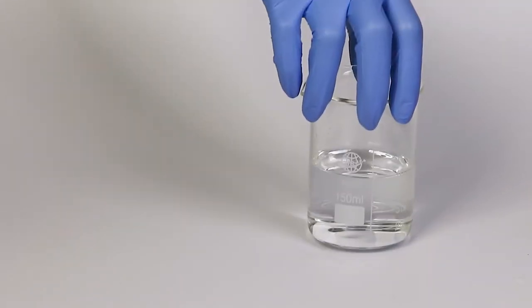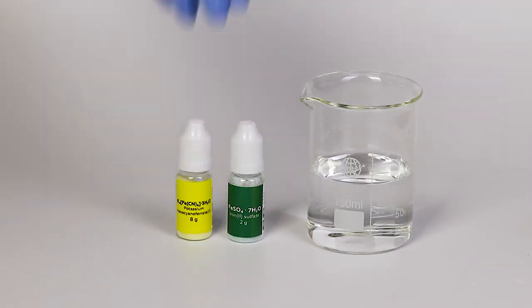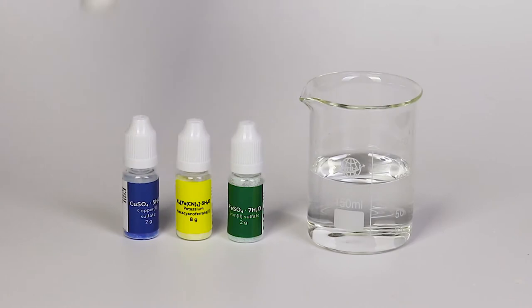For the chemical seaweed experiment, you will need 100 milliliters of water in the beaker, ferrous sulfate, potassium ferrocyanide, copper sulfate and zinc sulfate.